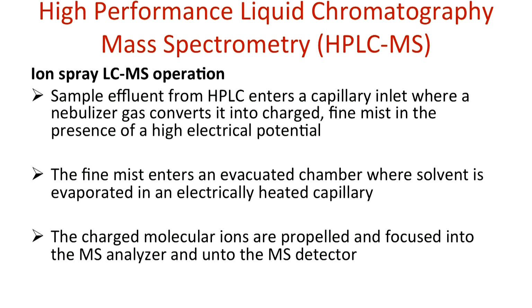Then the fine mist enters an evacuated chamber where the solvent is evaporated, and then it's heated electrically with a capillary, and then the charged molecular ions are produced and then propelled and focused to a mass spec and to the detector. So very similar to your GCMS.